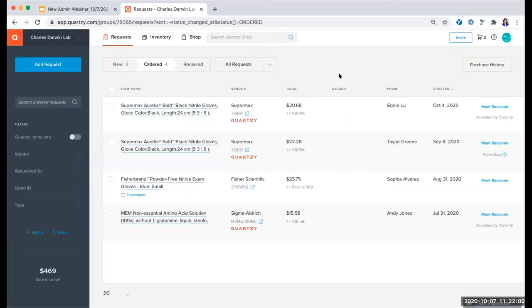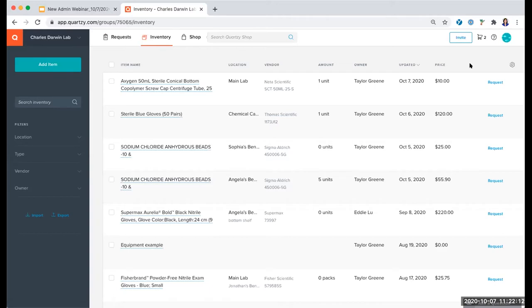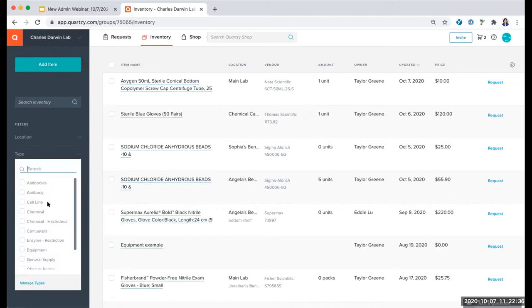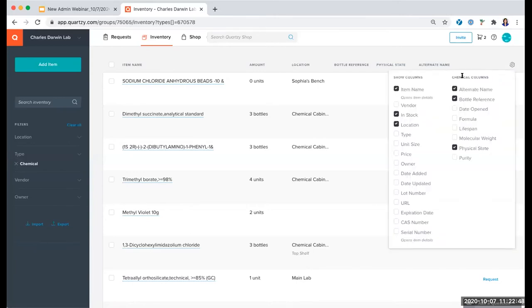Back in the inventory, we're talking about the column headers you can edit to track information in your one view. You have very similar filters and search as in the request module, but they're a bit different. In the inventory we have different filter options: location, type, vendor, and owner. If I want to filter by type — let's say the Chemical type — I may also want to customize my columns. I click on the gear icon and can select specifically from those custom fields for my chemical type. You just need to make sure you first filter by that type in order to see these options.